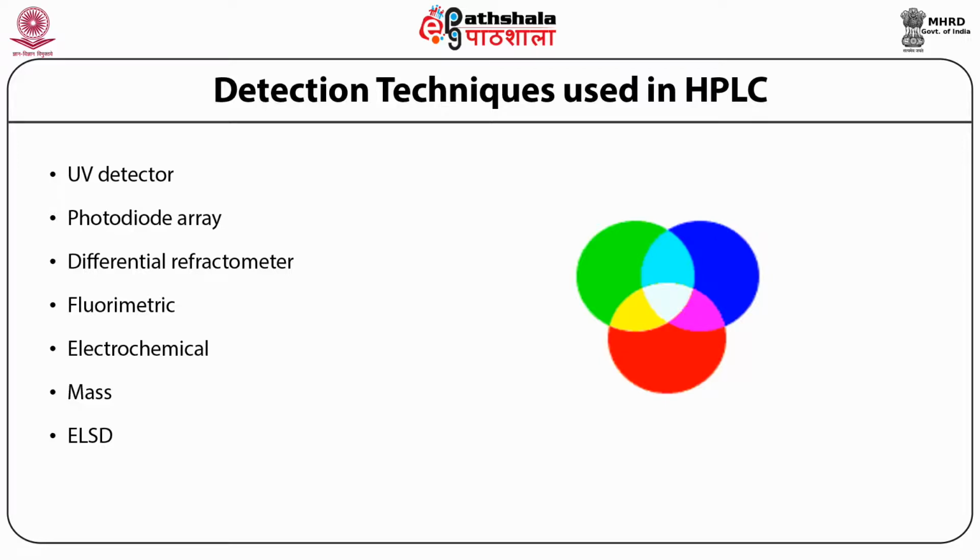Next is the electrochemical detector. The electrochemical detector was once widely employed for the detection of neurotransmitters. It works based on the basic fundamental of the redox potential of a compound, so amperometric or coulometric detection can be achieved by electrochemical detectors. Next come mass detectors. Mass detectors are pretty sensitive, pretty accurate, and different modes are capable of fingerprinting a compound to the highest accuracy possible.